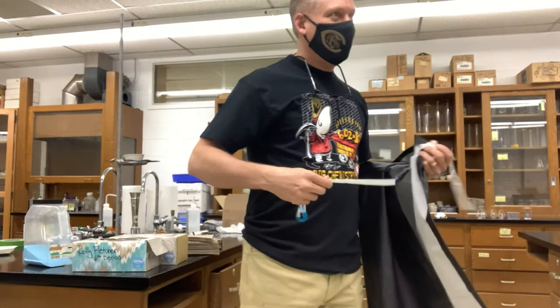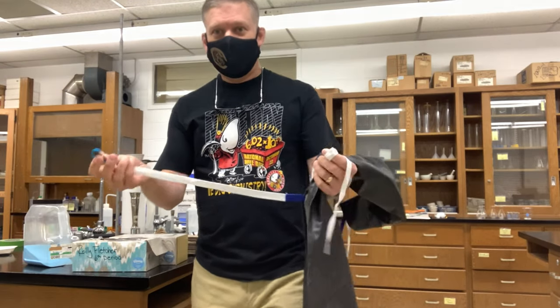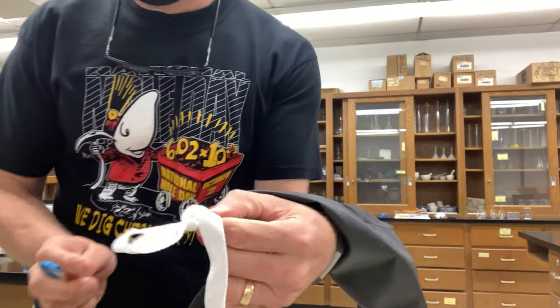We bought new lab aprons this past year during COVID. When they came in, she had a great idea: instead of having students tie their aprons and getting them in knots, we're going to tie a little loop in one side.